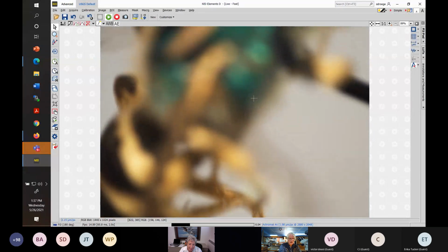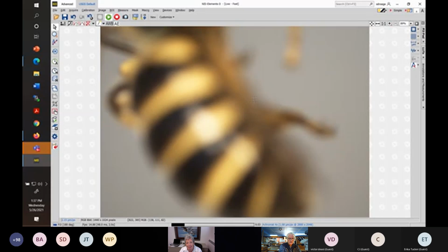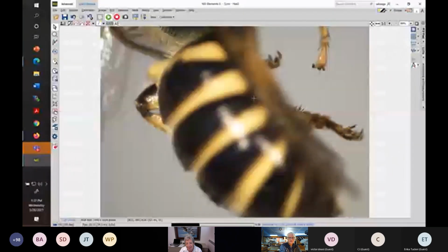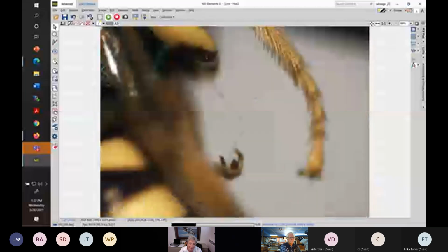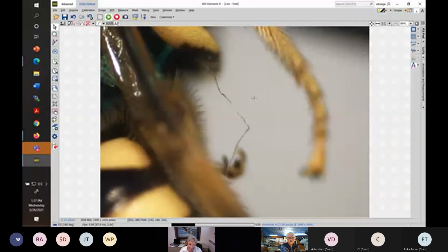All right, that's silhouette from the side. Twisting. Keep twisting. Try right there. Oh, upper right. Oh, I see it. Yeah. All right. Let me go more magnification. And oh, we have two legs of slightly different viewpoints.